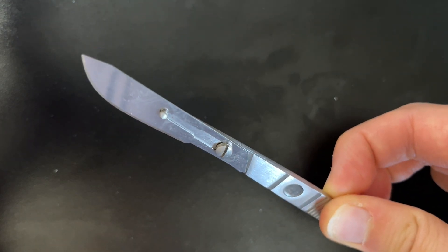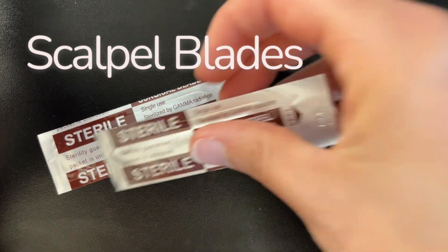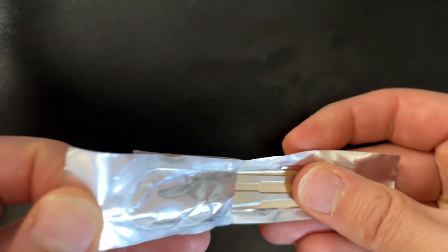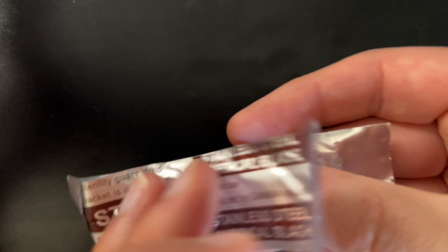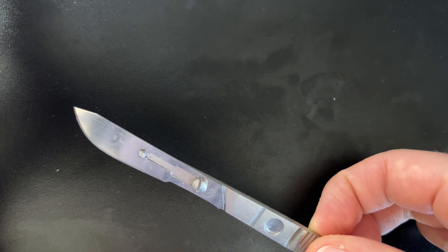Many dissection kits will come with replacement scalpel blades. These are removable and the replacement blades are sterile — though once opened, they are no longer sterile. In our dissection lab, there might not be a need for completely sterile blades, so you may reuse your scalpel blades depending on your teacher's instructions. Stay tuned for another video where I'll show you the technique for removing and replacing a scalpel blade. Be very careful, because even a dull blade can still cut you.